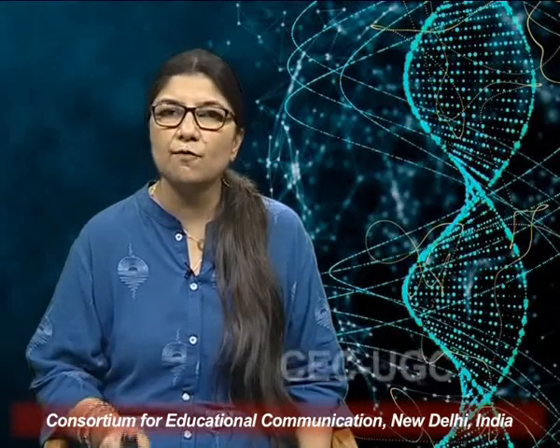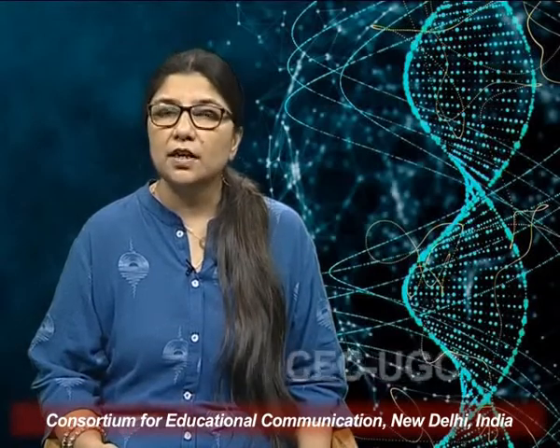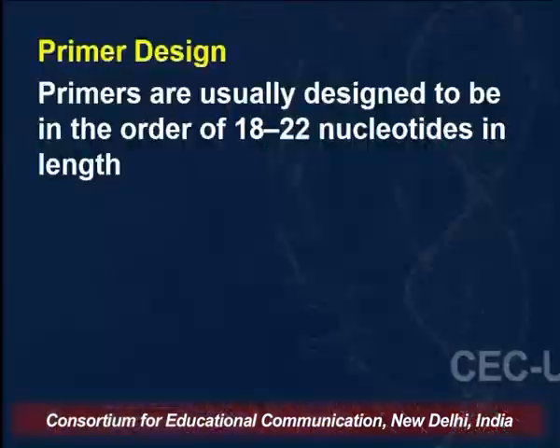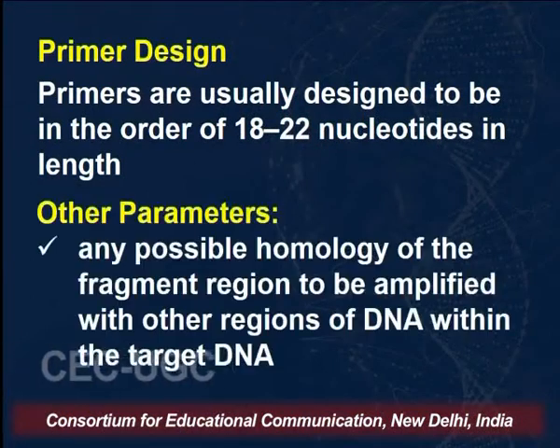So not the entire gene of interest, but wherever you are designing the primers, because the primers are designed based on the template DNA. So for that template DNA, you must know some sequence so that the amplification can be done and the PCR primers can be designed. Now the designing of PCR primers involves, usually as I said, primers in the order of 18 to 22 nucleotides in length.